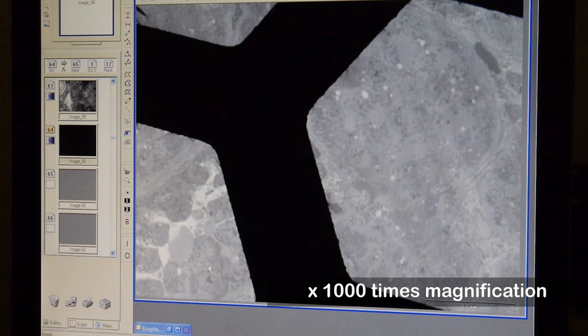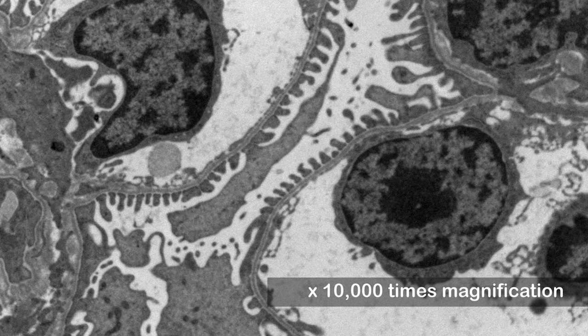At 10,000 times magnification, the structural detail is very clear.